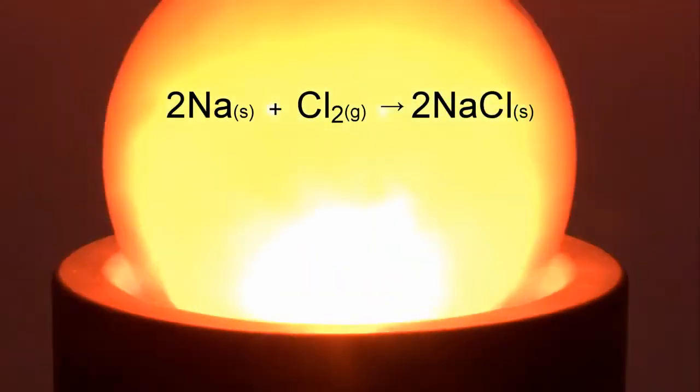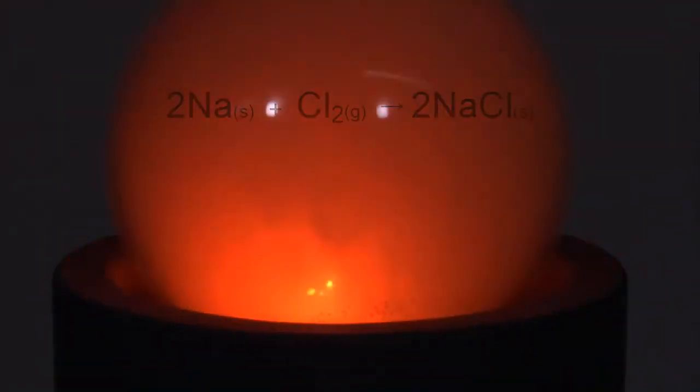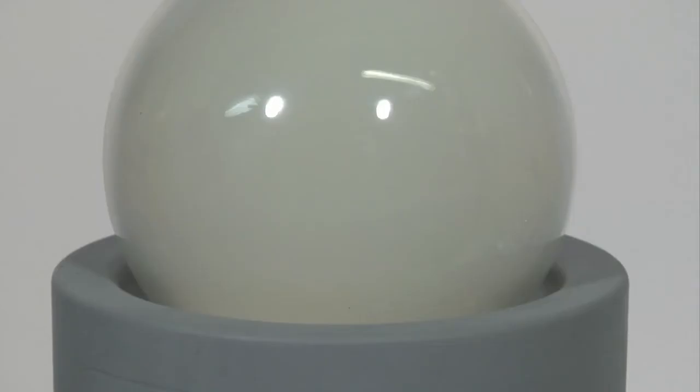The product is sodium chloride, which appears white only when excess chlorine has been removed from the flask.